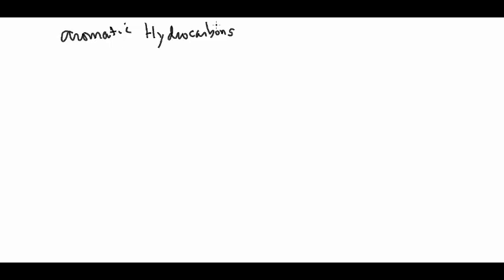What we find with aromatic hydrocarbons is that they will typically show a large molecular ion peak. And this is the result of the enormous stability of the aromatic ring. It has low compulsion to want to fragment. So the radical cations it forms will survive and make it to the detector intact. At least most of them will.